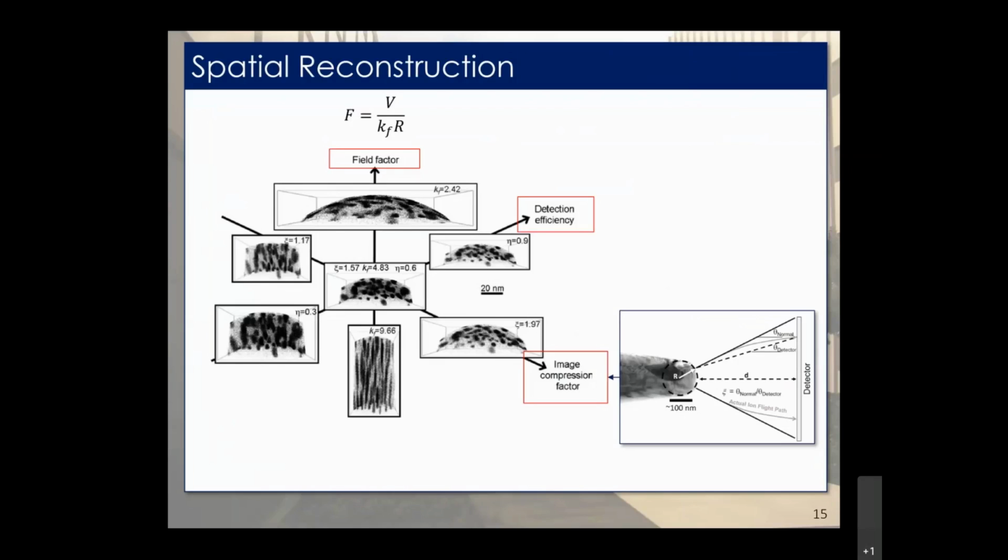Also, we will know a little bit more about our material and our atom probe. For example, with detection efficiency, we know it lies between something like 0.3 and 0.9, and we should be able to get a good estimation that will take us a lot closer than that, which is a very wide range. Finally, there are other ways in which we can calibrate the data set that I'll talk about in a moment.